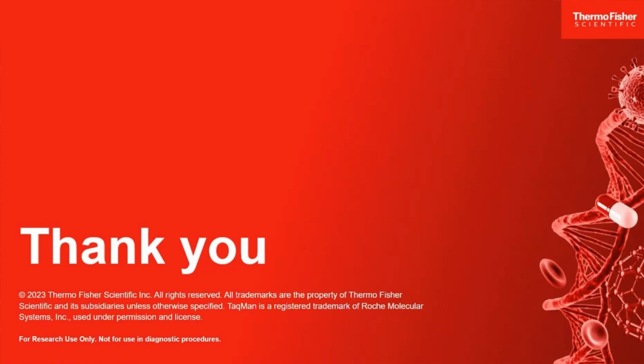What's more important, I think, by way of working, is: does the spectral signature of the pure dye that was used in the custom dye calibration process accurately match the dye that's on the TaqMan probe? I think that's a more important question. One way to answer that question is to amplify that assay with this new custom dye. Singleplex is fine. Use a chemistry that contains passive reference dye, most commonly ROX, and see if, as a result of amplification, we get a response in ROX.